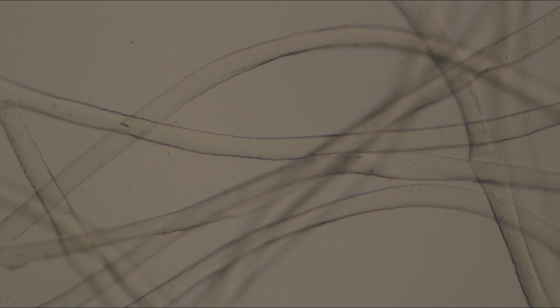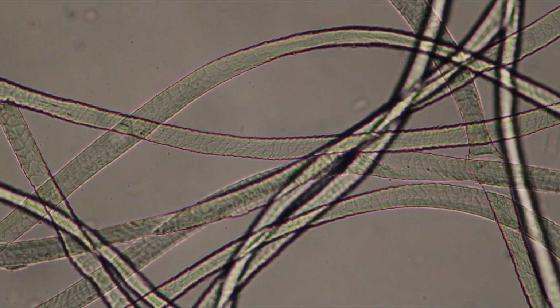Here this is wool, and here the condenser again is opened, and you can see the image is rather dull. Depth of field is very low. But when you close the condenser, what will happen is that all of a sudden you will see that also the fibers which are in the back are in focus. But look, especially on the right side, you can see that some of the fibers have very dark, almost black edges. These are diffraction patterns, and these are actually artifacts.